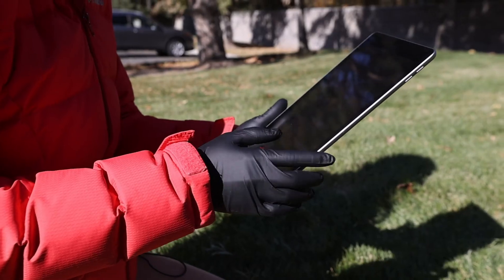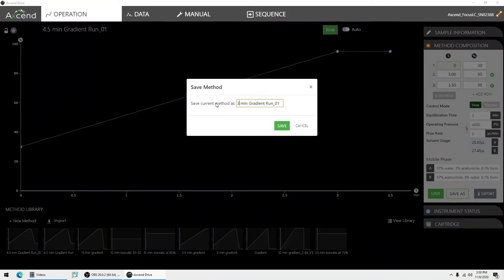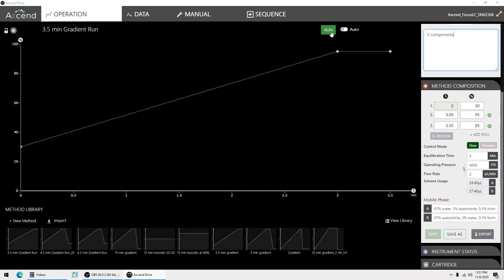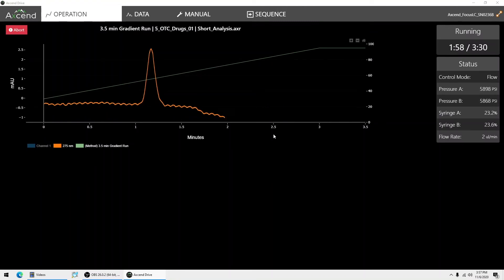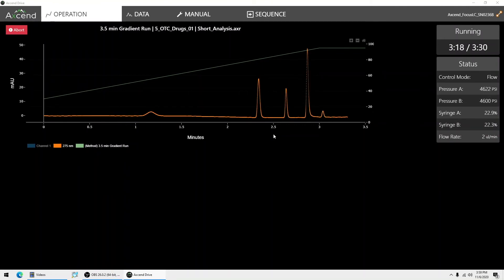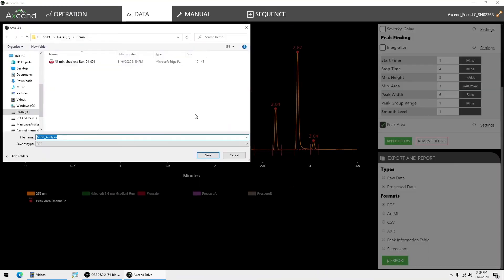To get you up and running in minutes, the Axcend Focus LC ships with an easy-to-use software package with a quick learning curve. This includes everything from method formation and chromatographic display to peak integration and data analysis. For scientists who wish to use full-featured CDS systems such as Agilent's OpenLab and ChemStation, DataApex's Clarity, or ChromPerfect, we ship a free driver for easy integration.